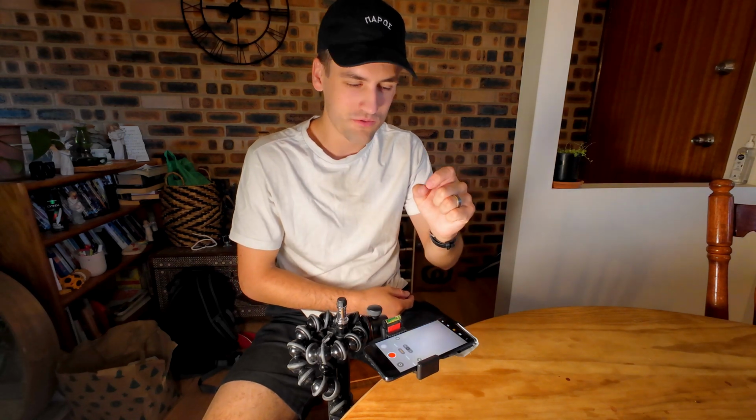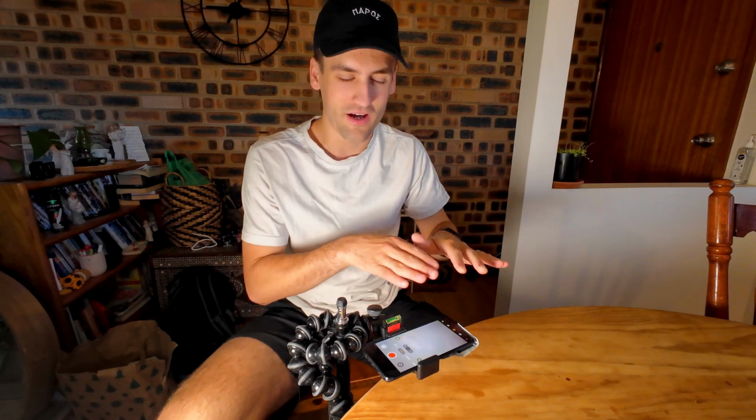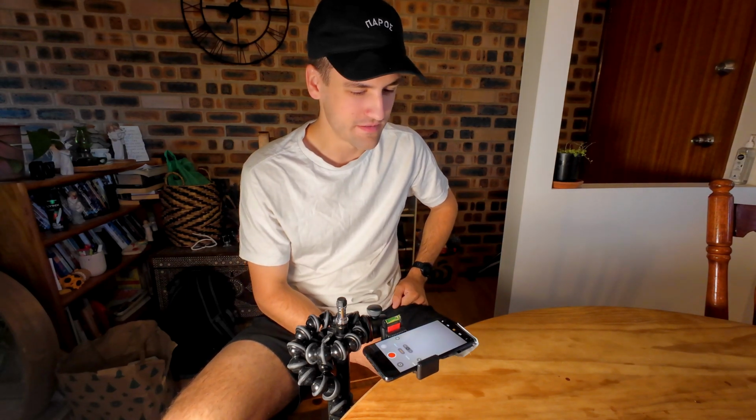That was remarkable. So that was just a sample of water from a lake that's about a 5-minute drive from where I live. And I don't know what that little critter was. He was so hard to track and try to follow on the microscope here, but I managed to get him. If you know what he is, please let me know down below.